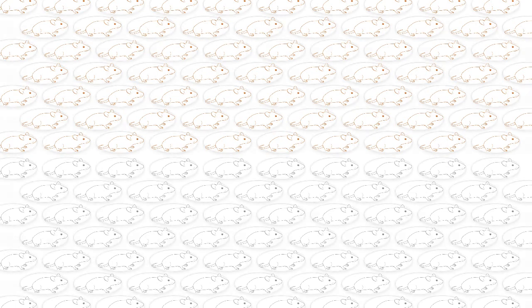So in this talk, I'm going to tell you about a vision for a new way of running behavioral neuroscience experiments that will allow individual researchers to run hundreds of mice. I'll mention that the main caveat is that this is still a vision. We're not there yet, but I'll show you the progress that we've made towards achieving it.